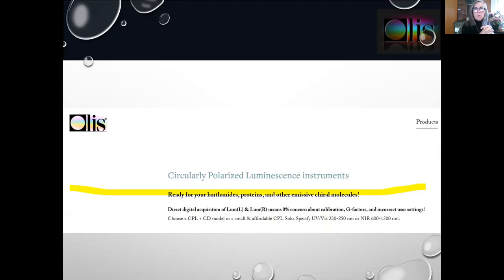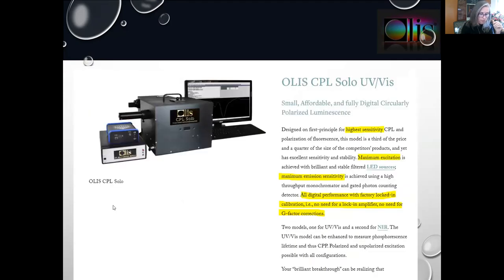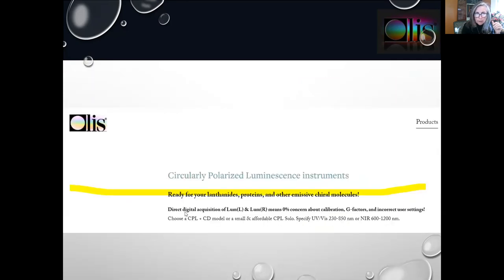This is the opening page of olasclarity.com, talking about the CPL instruments ready for your lanthanides, proteins, and other emissive chiral molecules. This next line is very important: direct digital acquisition of luminescence left and luminescence right means zero concerns about calibration, G-factor corrections, and the possibility of incorrect user settings.